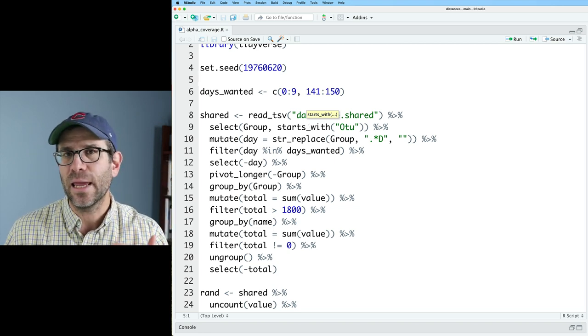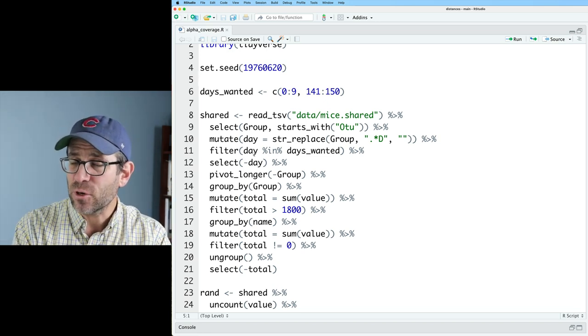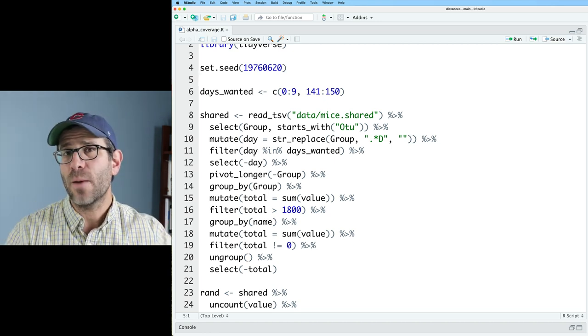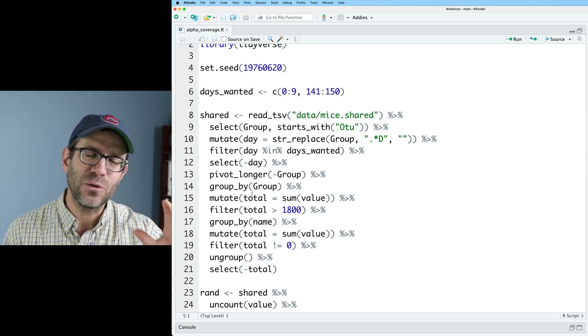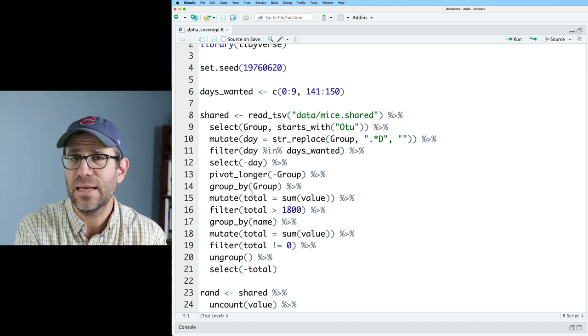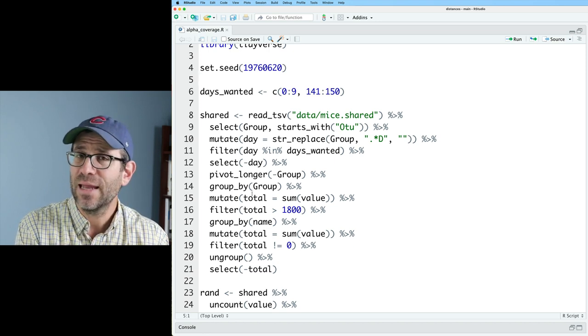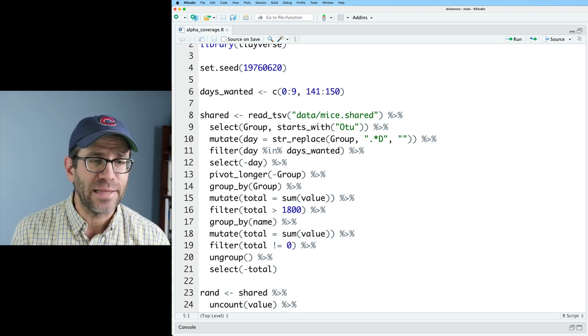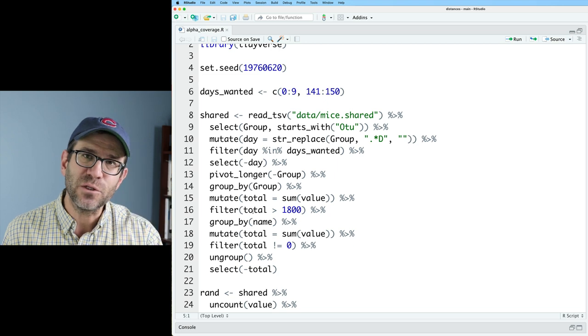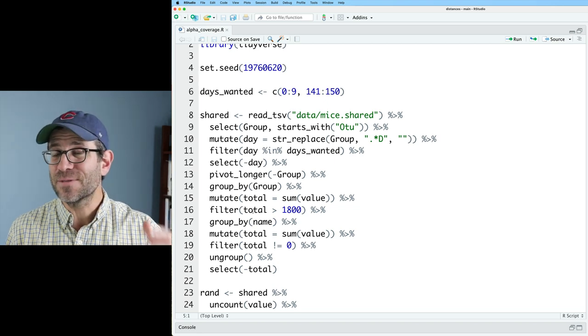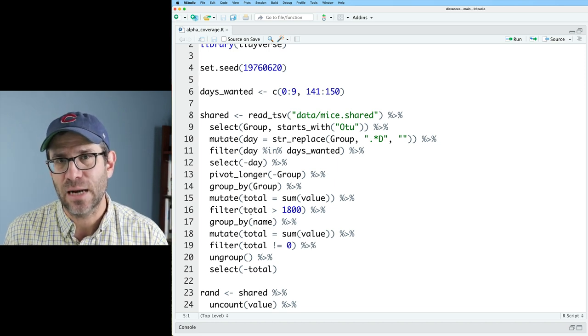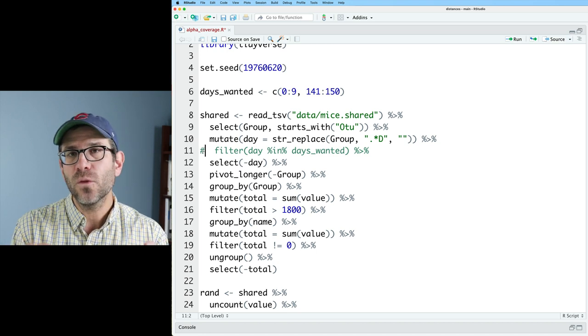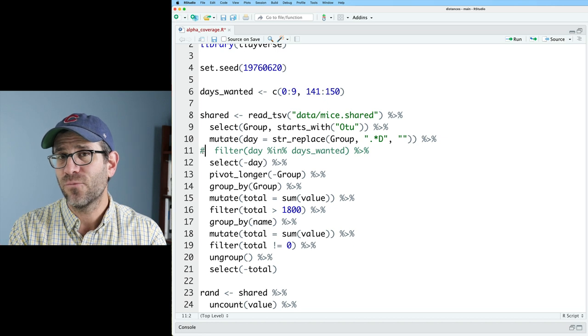And in this pipeline, we then read in a shared file. The shared file across the columns contains the different taxa or operational taxonomic units, OTUs as we call them, and the rows represent the different samples. You'll see a variety of different steps in here that we use to get the shared file into a tibble so that we have three columns: one indicating the group or the sample that the data came from, one indicating the OTU, and one indicating the number of times we saw that OTU in that sample.